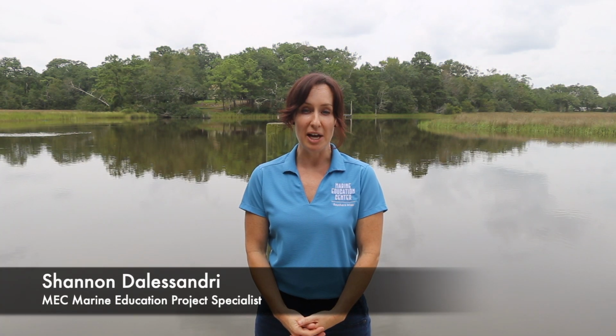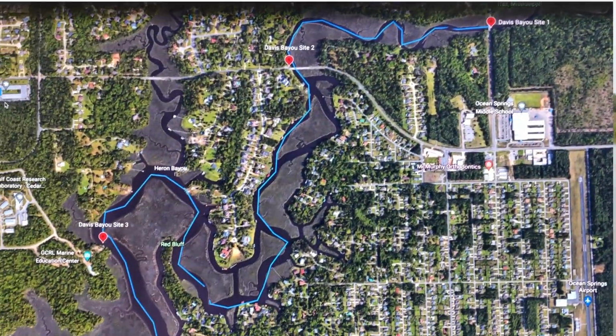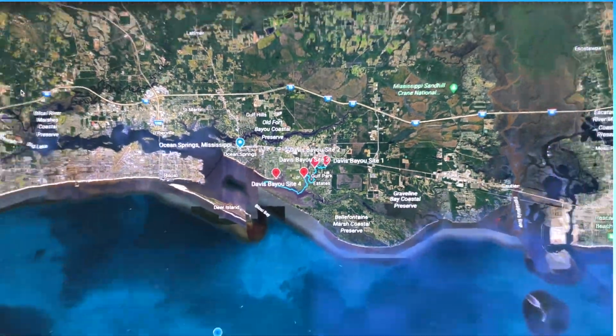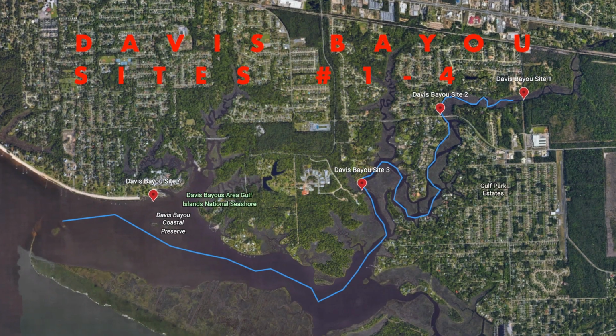We're here on the Davis Bayou, which runs through the heart of Ocean Springs, Mississippi, out into the Mississippi Sound and eventually the Gulf of Mexico. We're going to be testing 4 sites along a saltwater gradient.